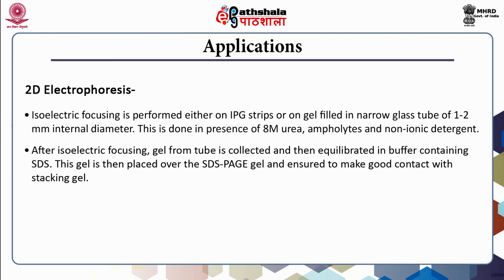This gel is then placed over the SDS-PAGE gel and ensured to make good contact with the stacking gel. Contact can be further ensured by pouring some molten agarose. When the agarose gel is set, SDS-PAGE is initiated.